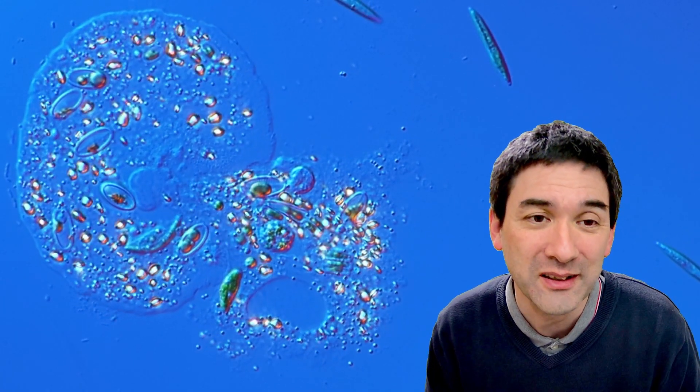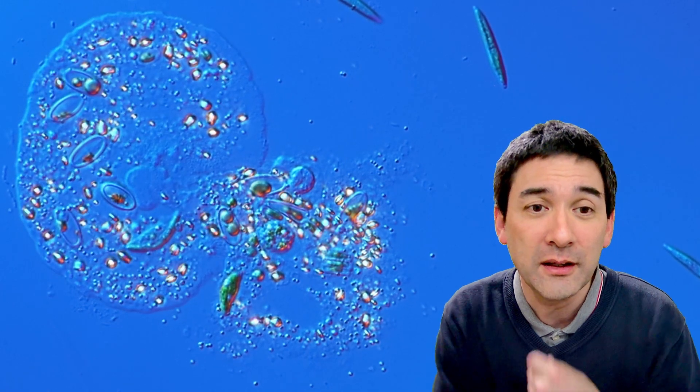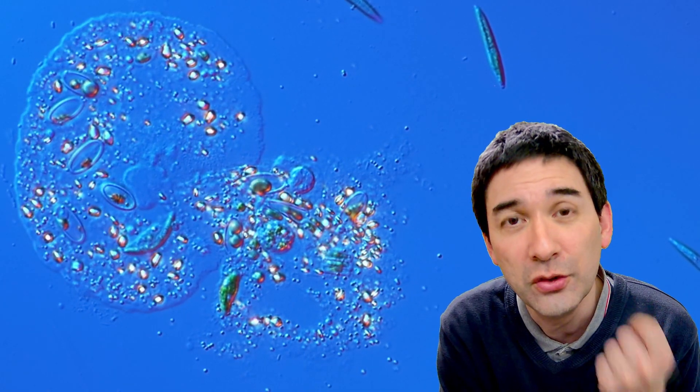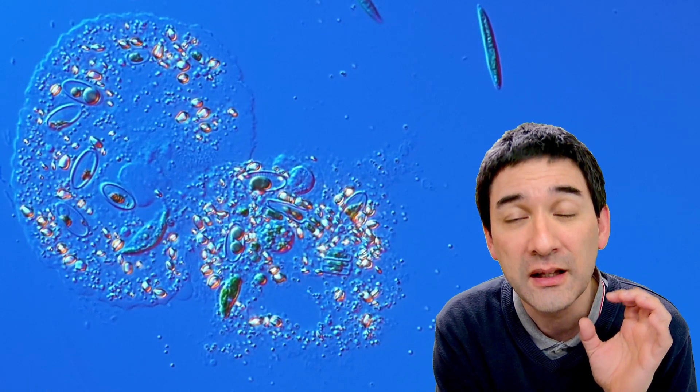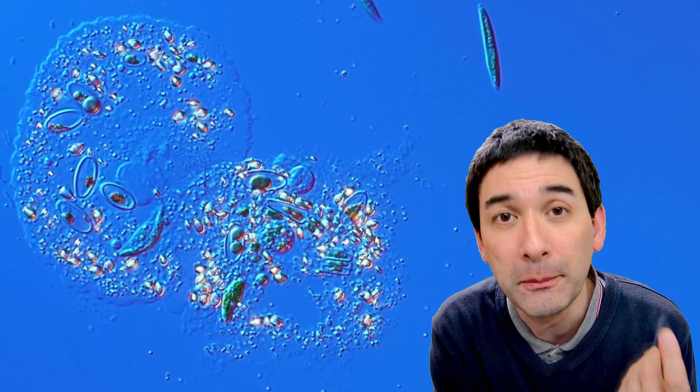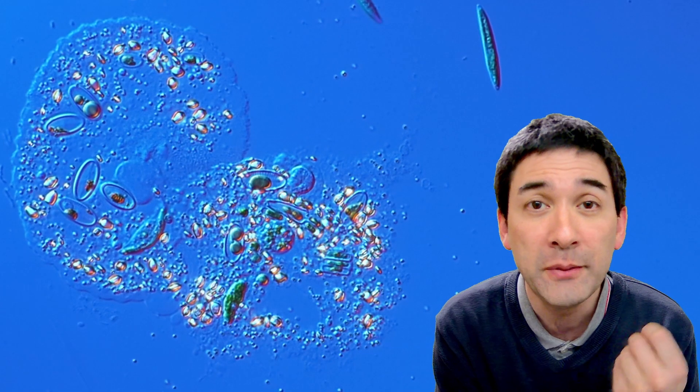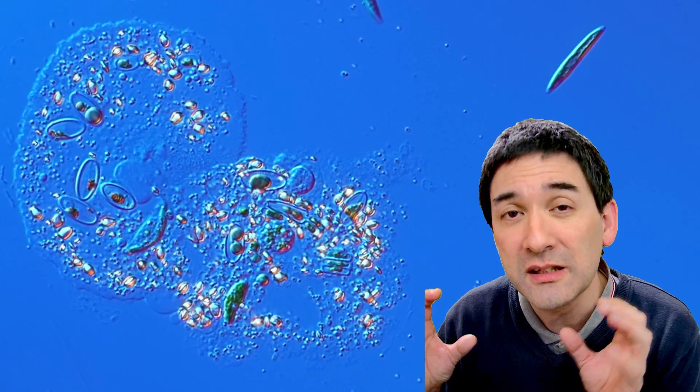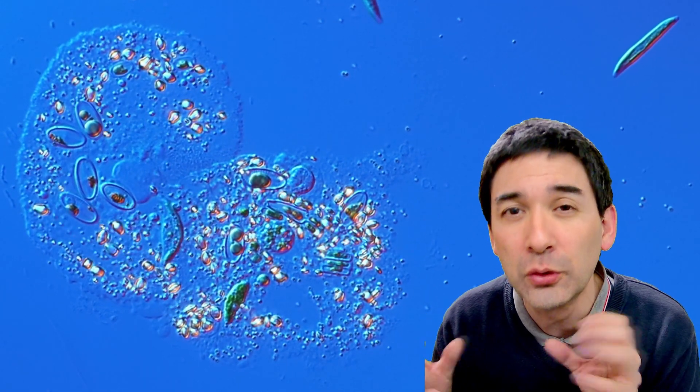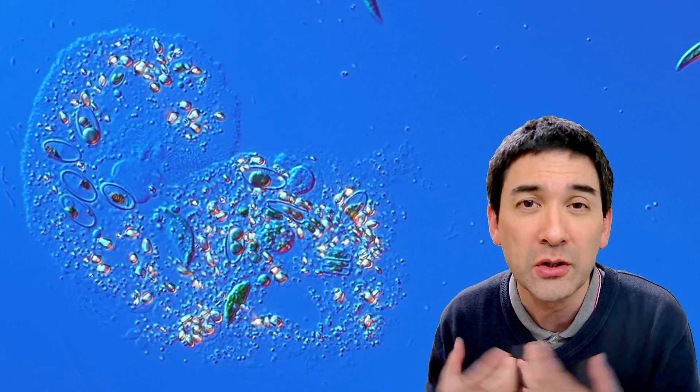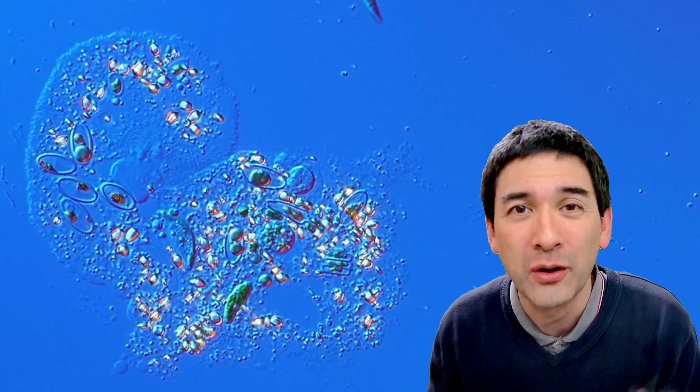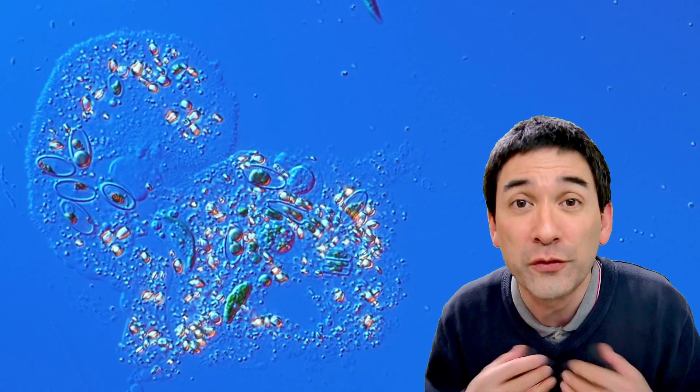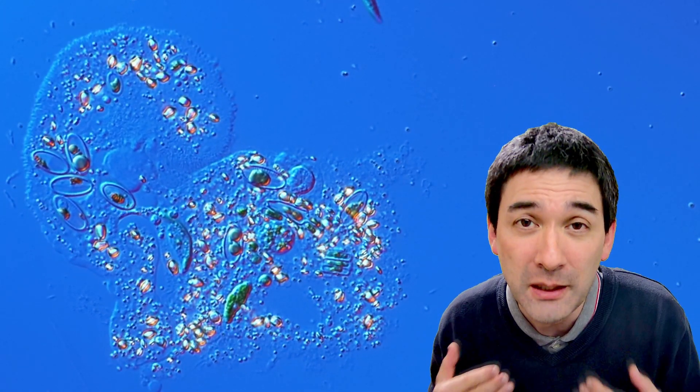Yeah here we go again, look at this, doesn't it look great? Okay, well what I would like to encourage you to do is that if you actually ever put a water sample under the microscope, then attach a camera to it and then speed up the video later on. Because those amoeba move a little bit slowly and can therefore be a little bit difficult to see and observe because of the slow movement. They're kind of very quickly overlooked because there are many more other microorganisms around that move much faster.